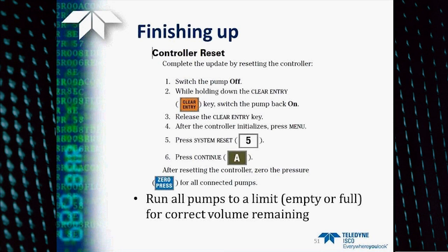And then the next step we want to do is clear out the memory in the controller for the new software. So we hold down the clear entry key while we turn the pump back on. Then after about 3 seconds, we release the clear entry. The controller should say it's initializing.